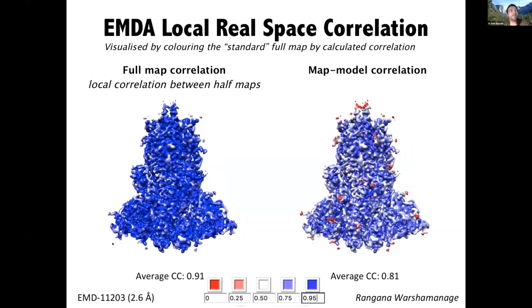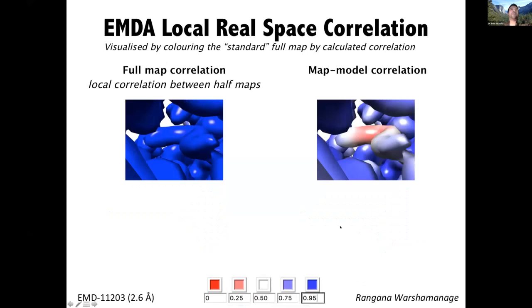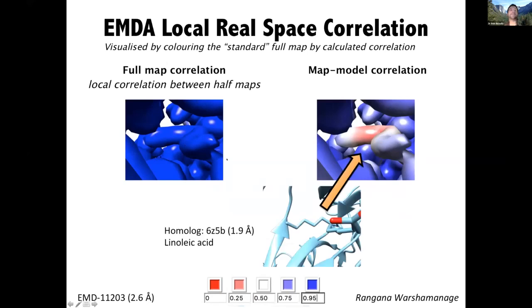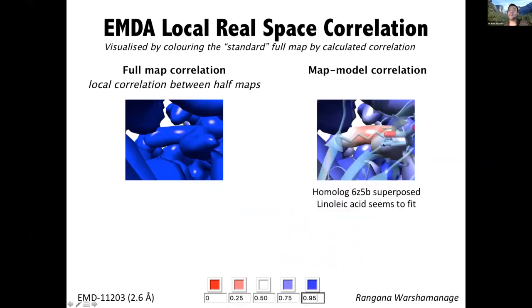Here's another case where we have a good full map correlation between the half maps, but lots of red on the surface indicating poor map-to-model correlation in small regions. Focusing on one such region, something has not been built there, yet there is a good local correlation between the half maps. Considering a homologue, there is actually a linoleic acid built in that region, and if we superpose it, the linoleic acid appears to fit.